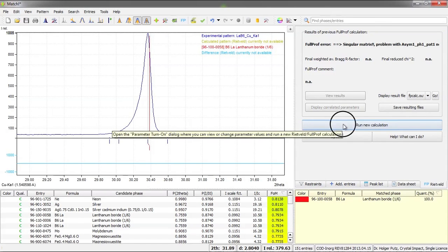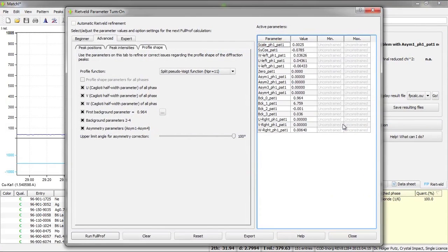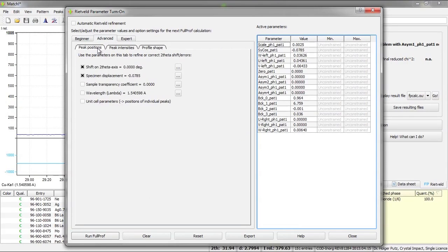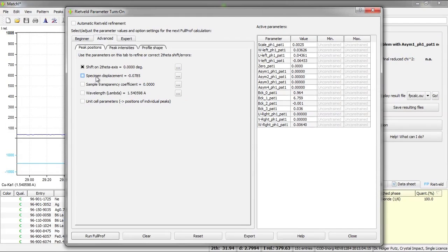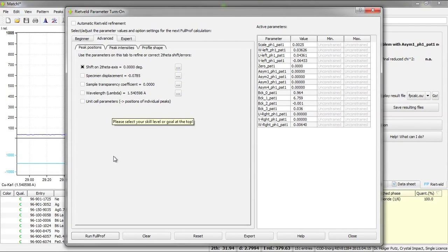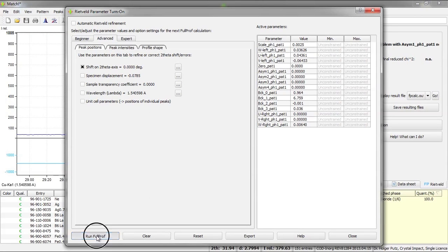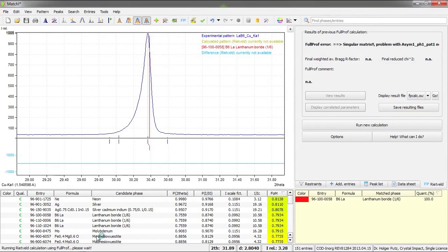I will again press the run new calculation button here and go back to the peak positions tab and remove the hook for the specimen displacement, so that this parameter will be kept fixed. Now we will repeat the calculation and let's see if it works now.